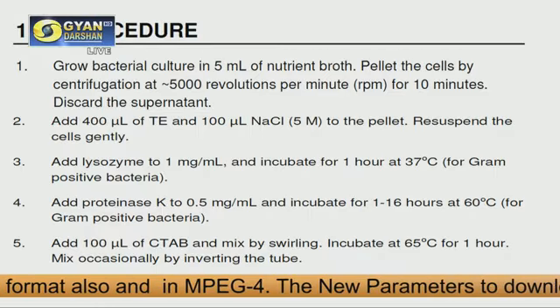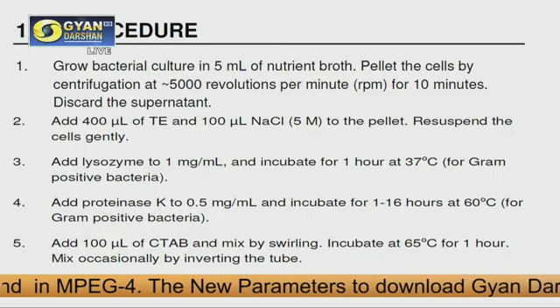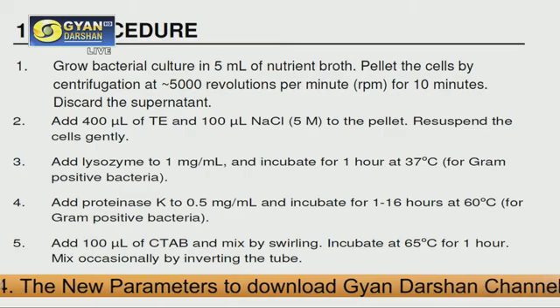Why are you adding RNase A? Because you don't want RNA. You want to avoid RNA contamination. So you are adding RNase A, which is another enzyme that will degrade the RNA, but not the DNA.